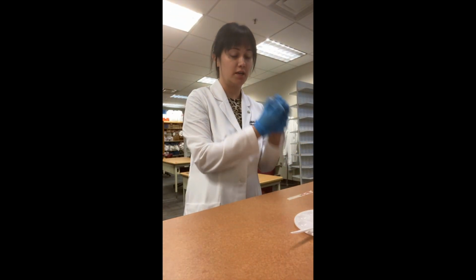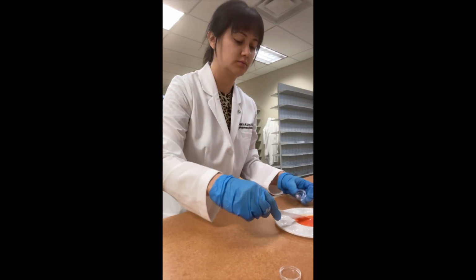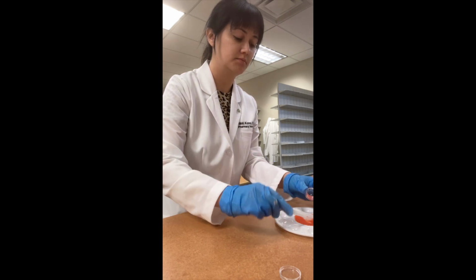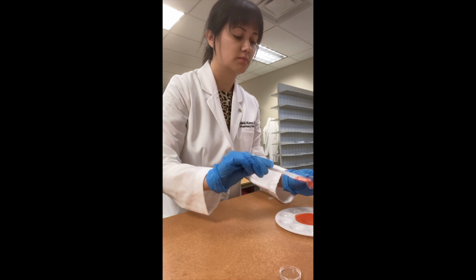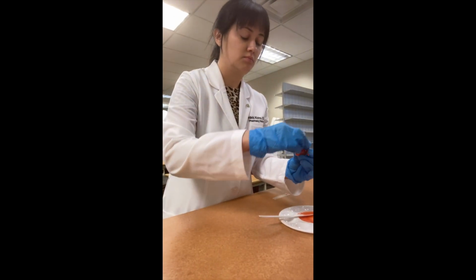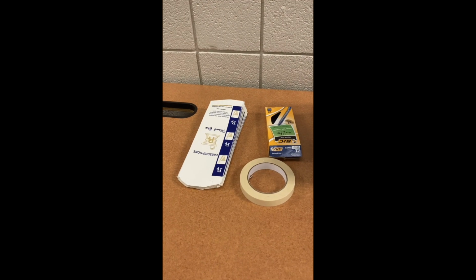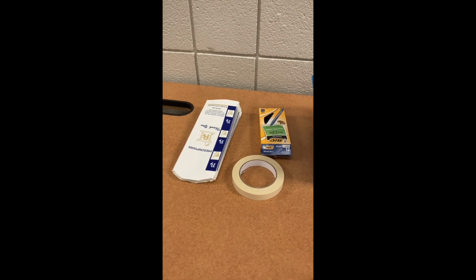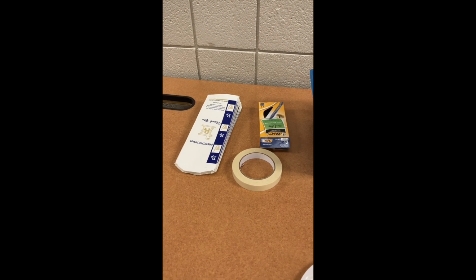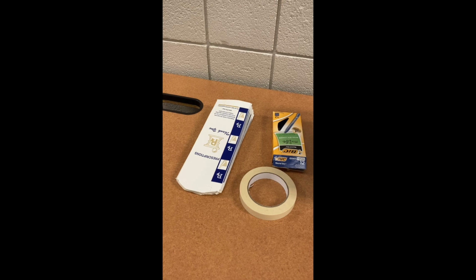So here I'm going to take an ointment jar and scoop up my paint and put it in here. So after putting your product in the jar, make sure to take the masking tape and label it, and then put it into a prescription bag for the pharmacist's final check.